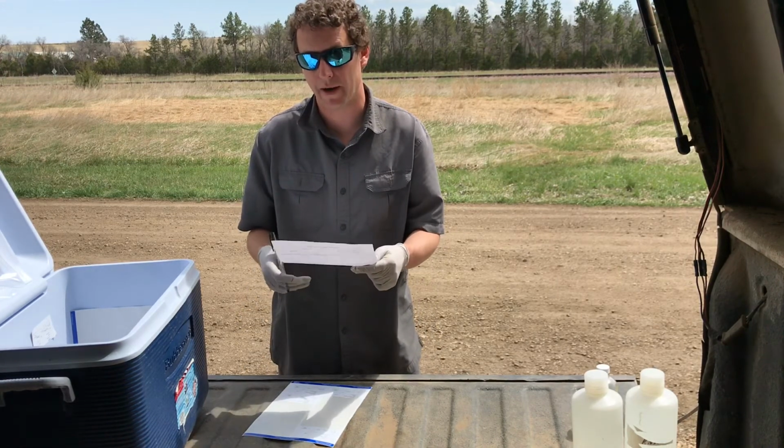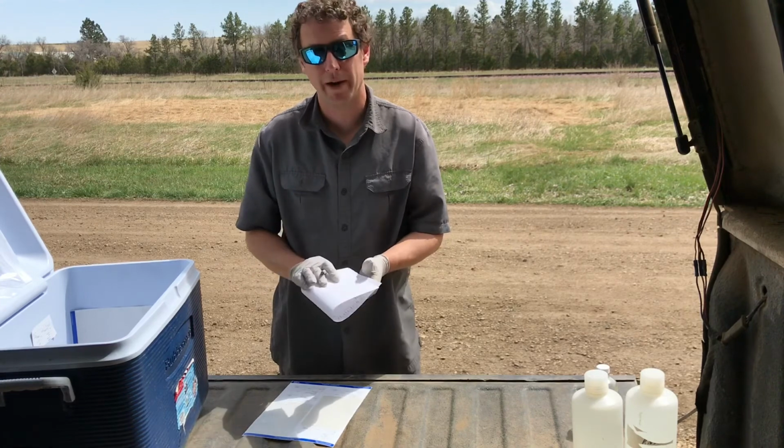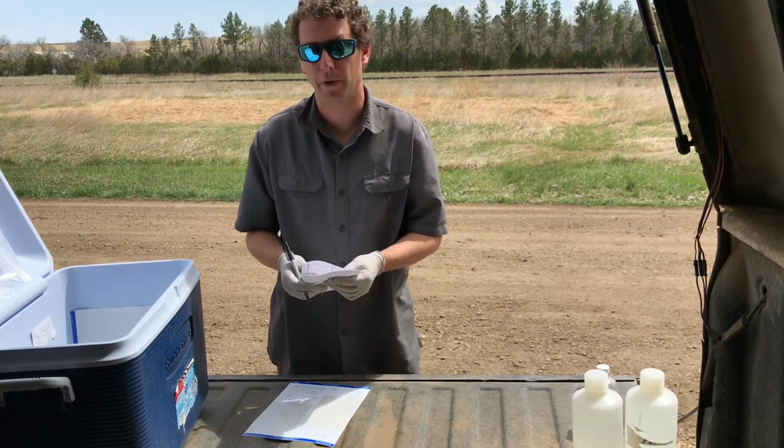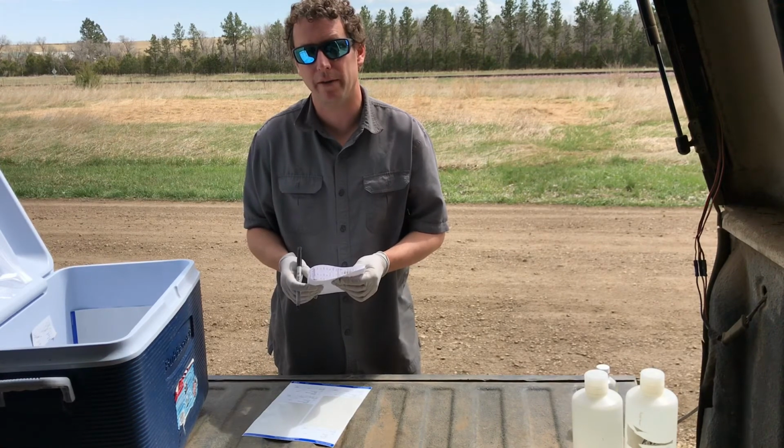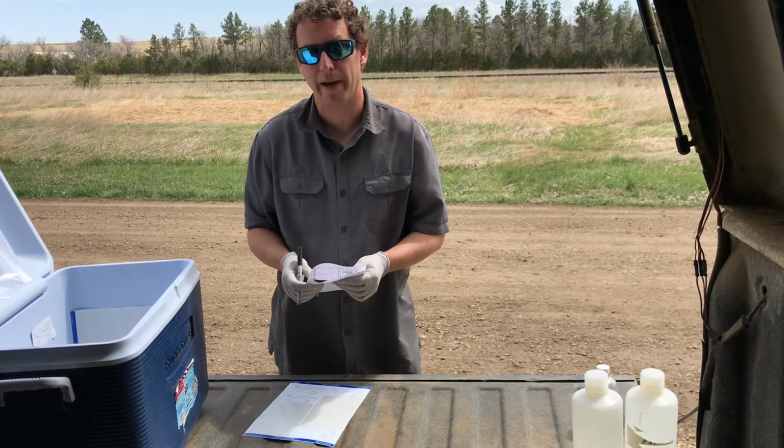And then put your data sheet in a safe place wherever you keep your data sheets until you ship your sample. I keep a folder in my work truck, and that seems to work really well. Then when I'm ready to ship, I put all the data sheets inside the cooler lid in a Ziploc bag.